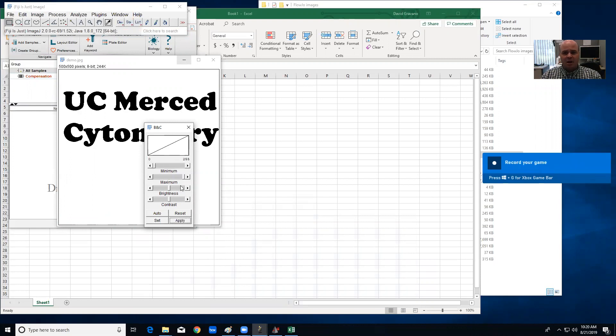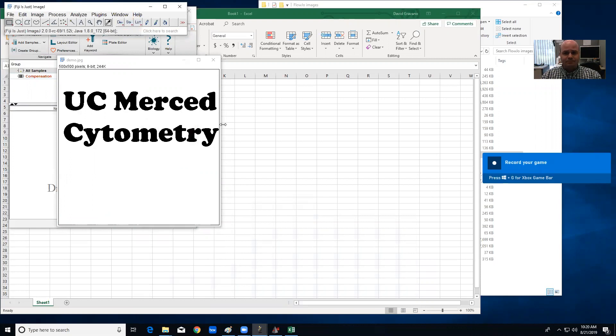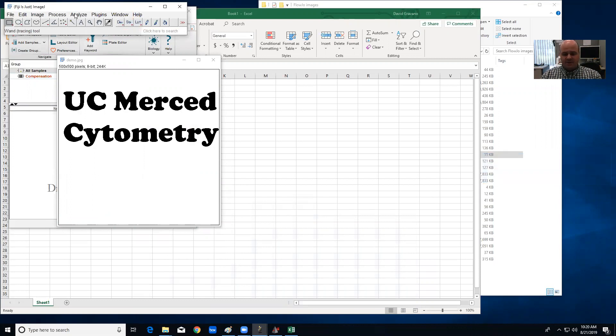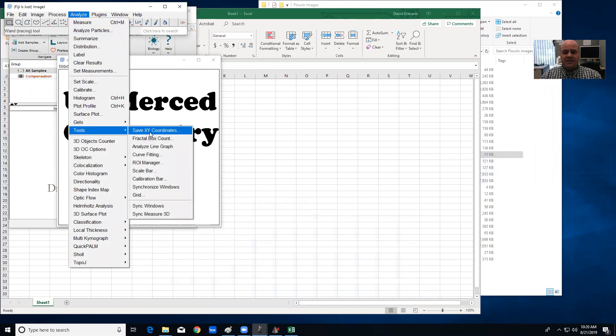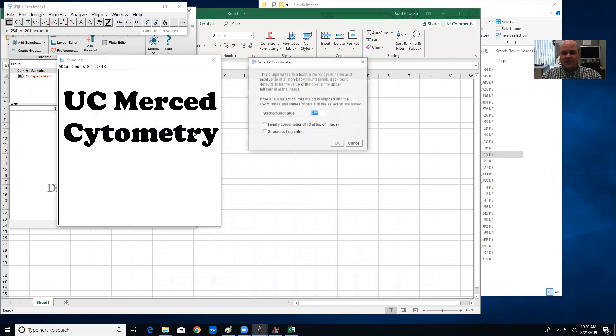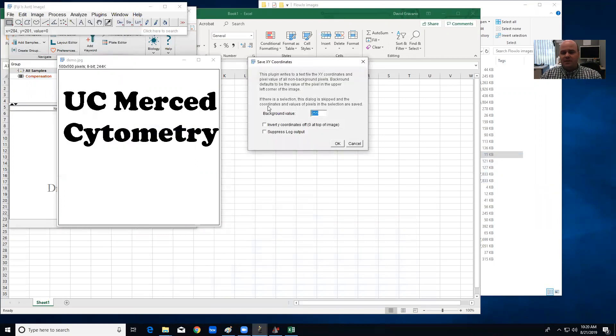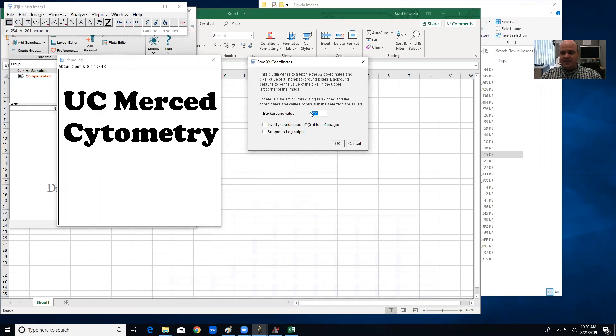Next I'm going to get the coordinates, so the XY coordinates. If you go to Analyze, Tools, Save XY Coordinates, what that's going to do is give you every pixel coordinate that is not background. And in this case background is 255 brightness value, so that's white. Pixels is background, so it's going to basically tell me every pixel that's black. And I'm going to hit okay here.